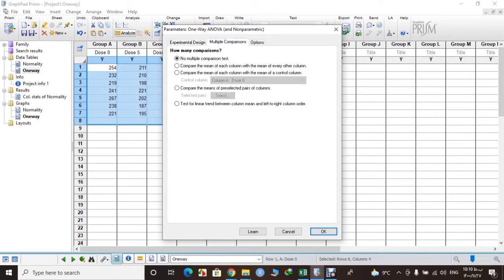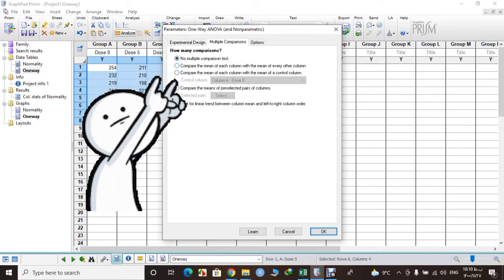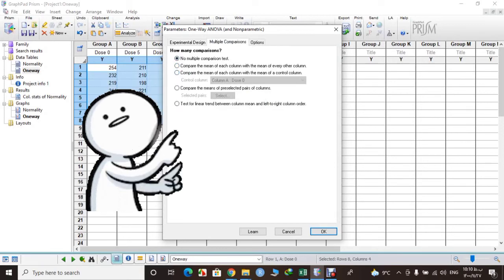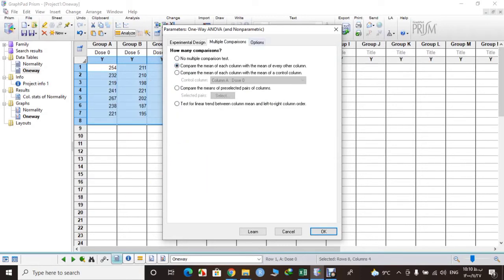And let's check on multiple comparison. I want to compare the mean of each column with the mean of another column. You can select the third one, it's up to you.